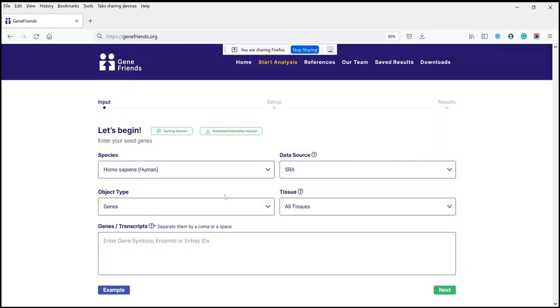So let's get started and look at the main features. There are various options. One of them is in terms of species, but it's important to point out that there's way more data for humans than for other species.